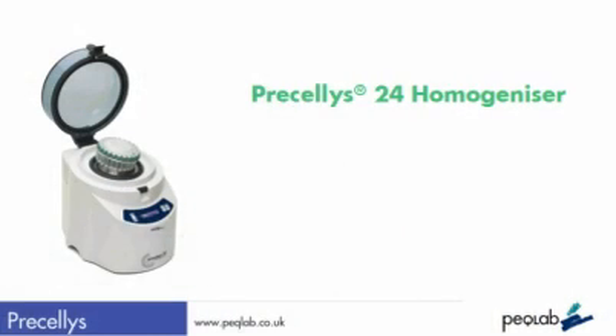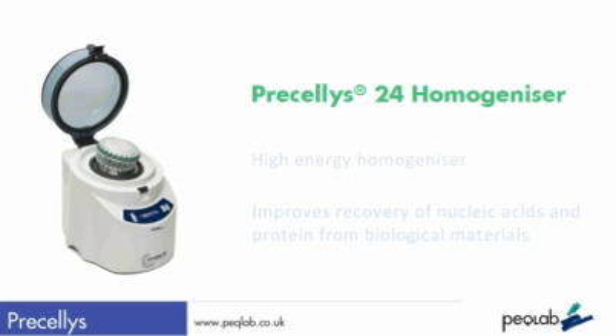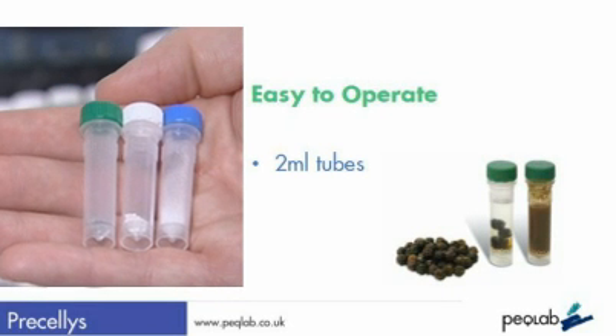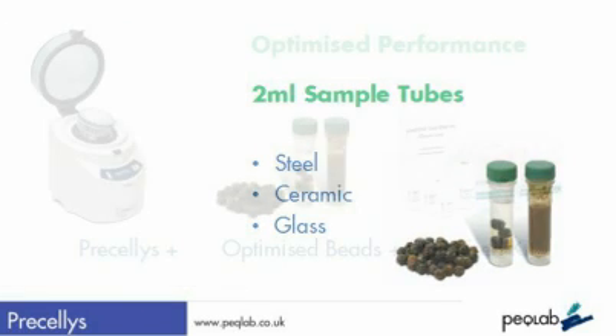This is a short demonstration of the Pracillis 24, a high-energy homogenizer using bead-beating technology designed to improve nucleic acid or protein recovery from biological materials. The system uses 2 ml tubes filled with grinding beads — steel, ceramic, or glass — and is fully optimised with Peclab purification kits.